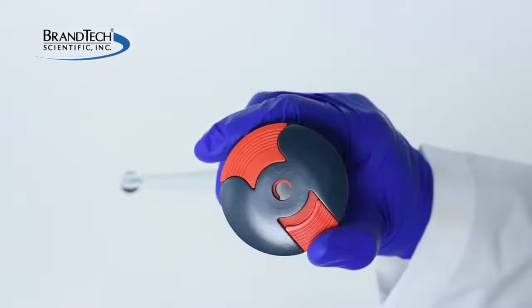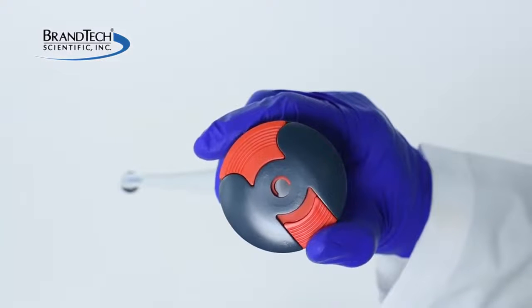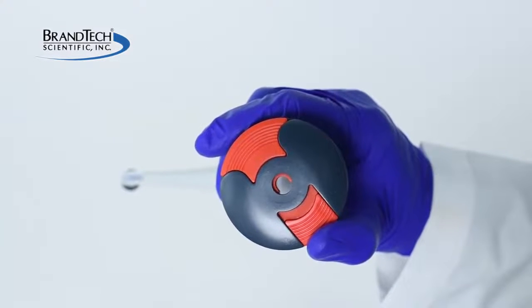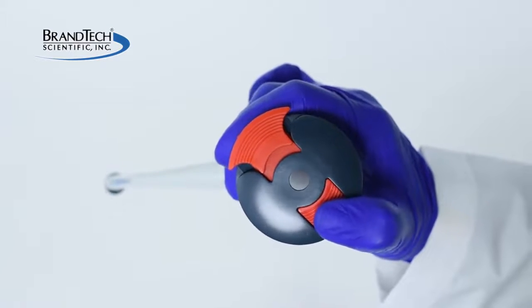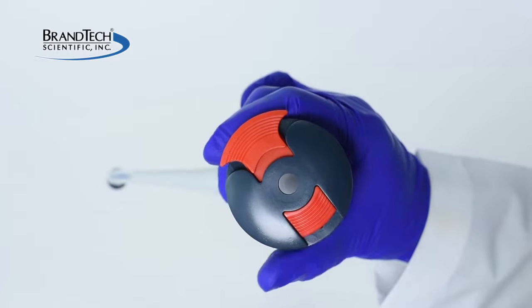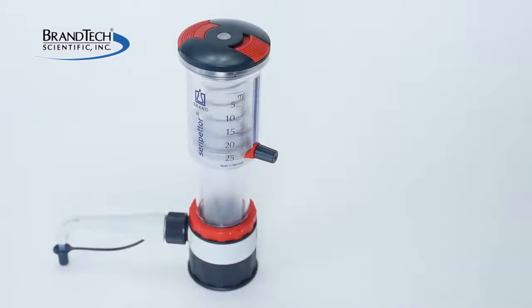If you can still see through the hole at the top of the pump assembly, the dispensing cartridge has not been locked in place and will not function properly. Slide the red piston lock to the open position, then repeat the process ensuring that the white tab fills the hole.